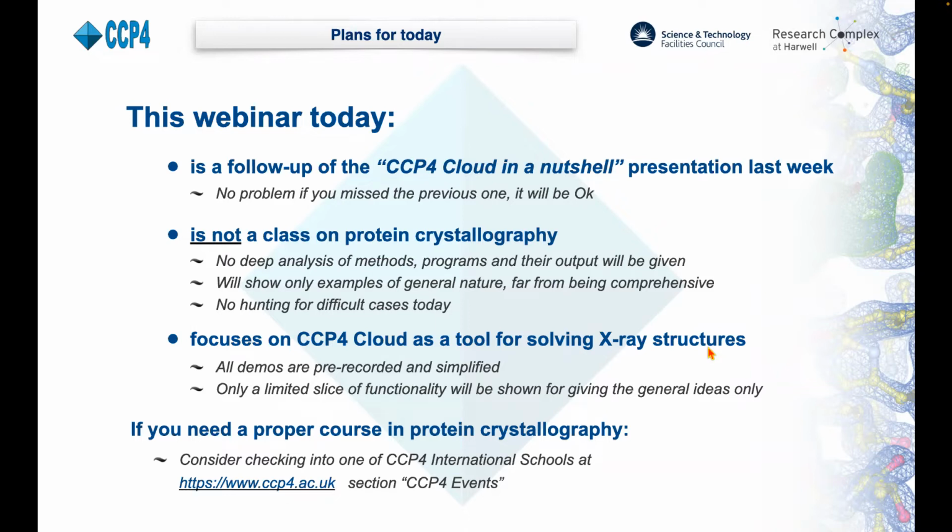But I would like to stress that I'm not going to run a class on crystallography today. Please don't get this wrong. Therefore, do not expect in-depth analysis of various programs, their input and output, and particular recipes for difficult cases. Not at all. Instead, I will focus on CCP4 Cloud as a tool for solving X-ray structures.